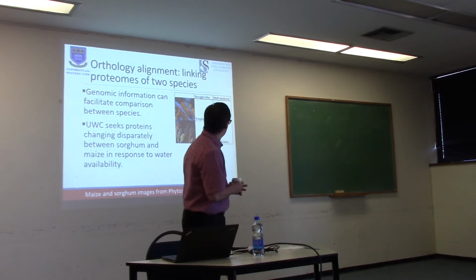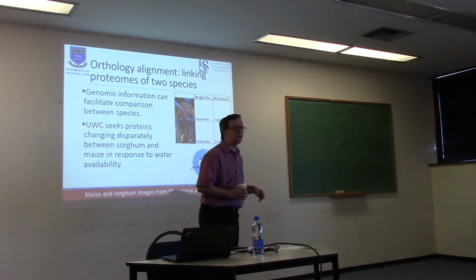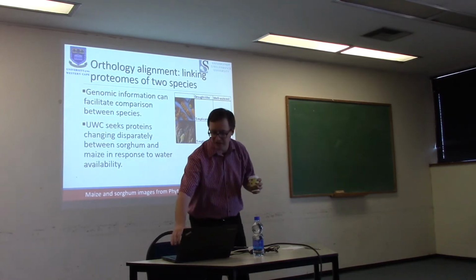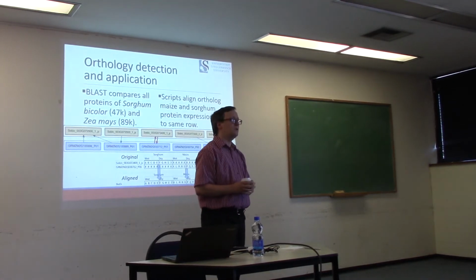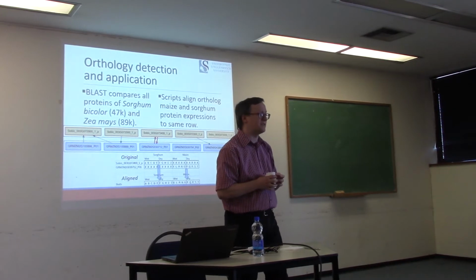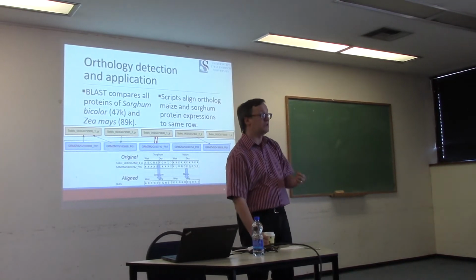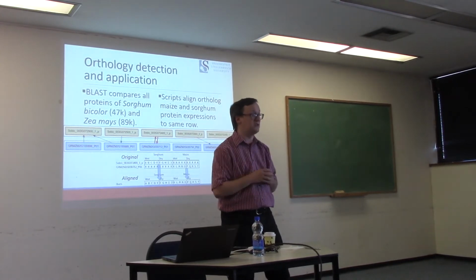Oh, so these data were all produced over at CPGR. I've just included their logo without the name, but CPGR generated the 20 raw files corresponding to this experiment. So we decided on a 2-step process for this. The first would be establishing this map of orthology between the whole proteome sets of these 2 species.